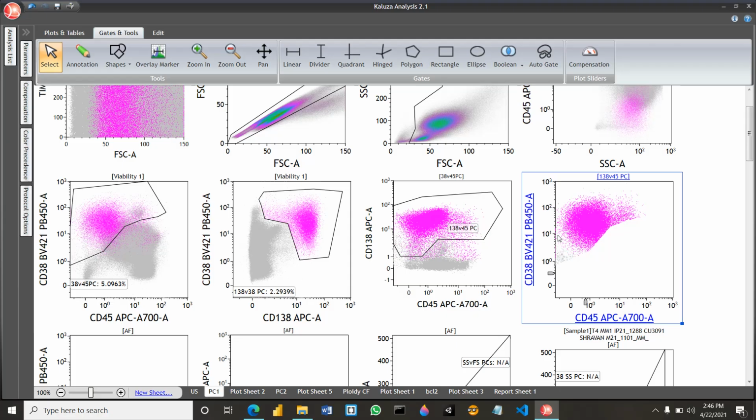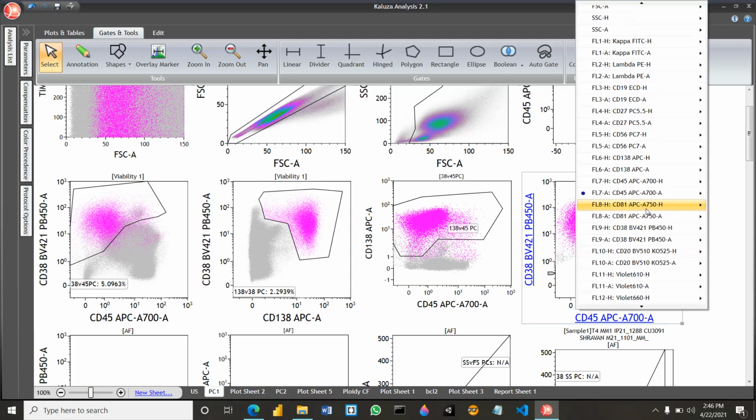So you know that these are the cells, and you can get these cells finally as a final plasma cell.